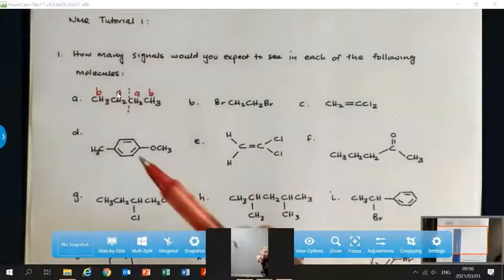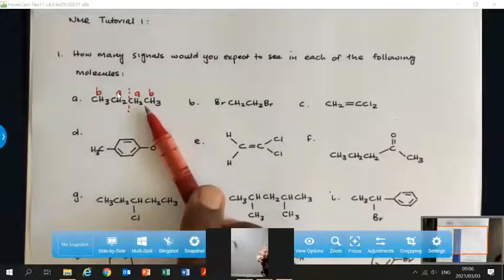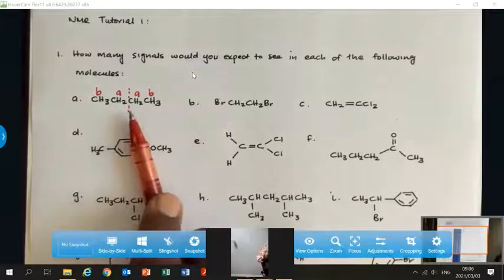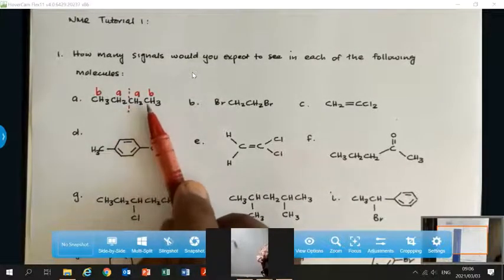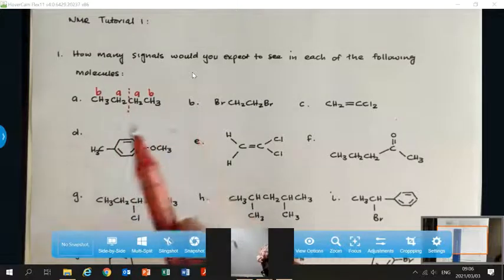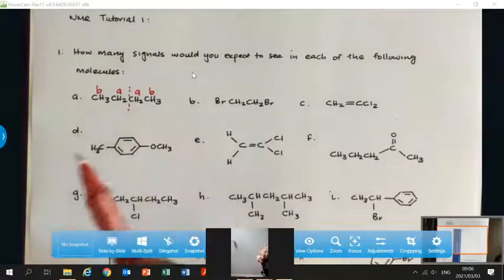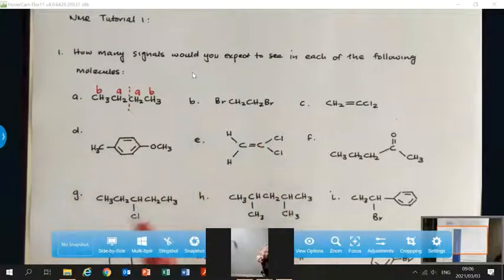because they are equivalent. Remember that the hydrogens on a particular carbon are always equivalent unless there are some other extenuating circumstances, right? But generally, in a freely rotating molecule, because the CH3 group rotates around the carbon axis, the 3 hydrogens average out, right?